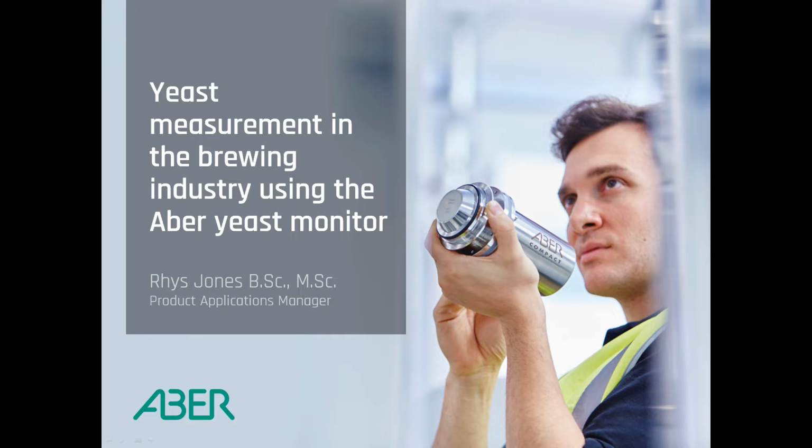During the course of this presentation, we'll try to cover a few of the basic topics: who we are, the basic principles of the Aber technology, its application, the calibration process, and then the system aftercare.